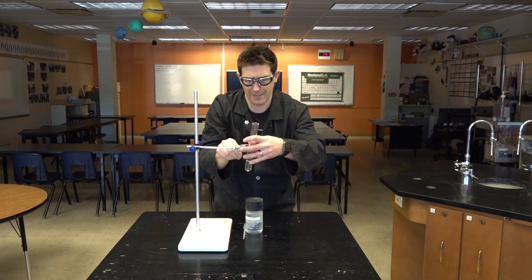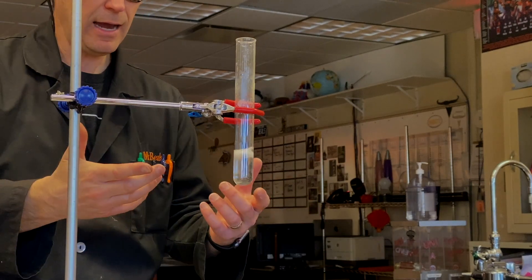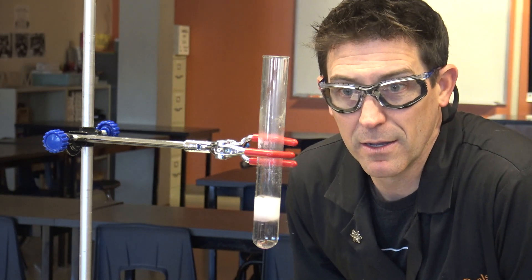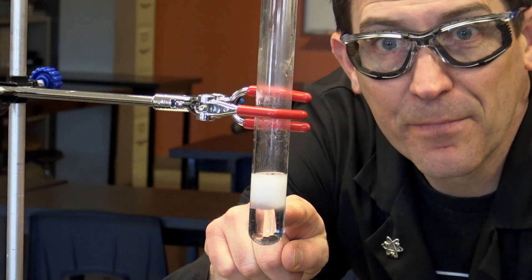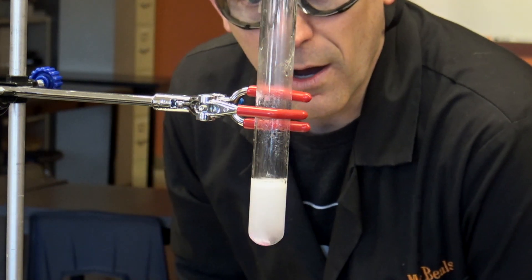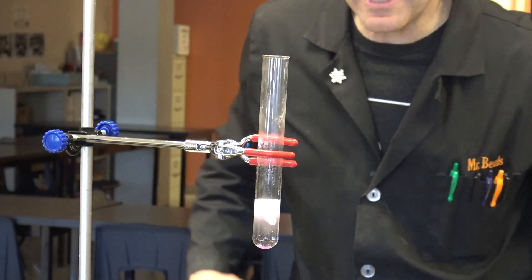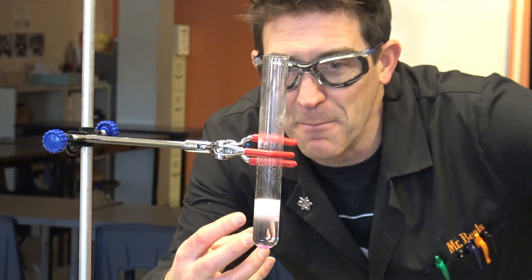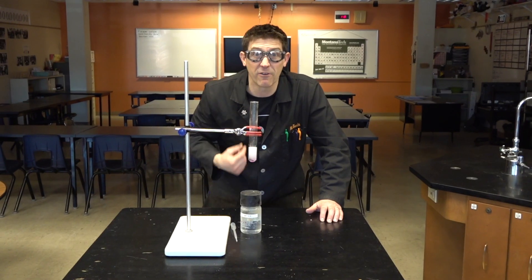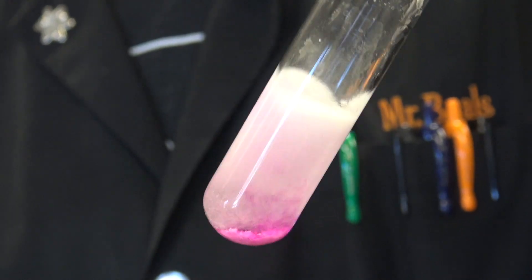Now we can keep this going — produce more hydrogen gas. Can you see the snow falling in there? We've got so many things going on. And now it's starting to turn pink again. We're getting snow crystals that are falling down. Should we add some fire? There's so much to learn from this little tiny test tube.